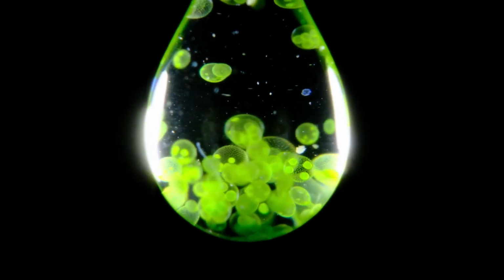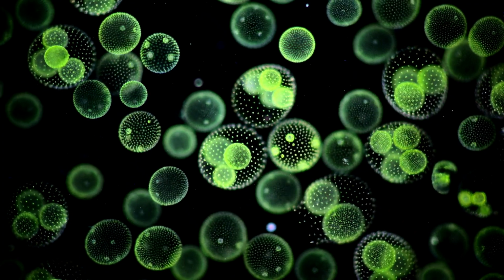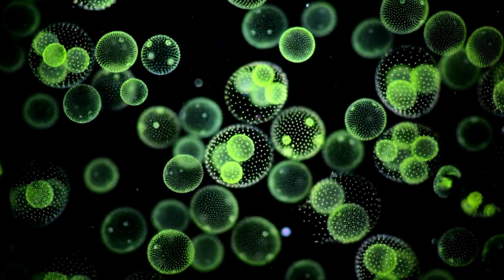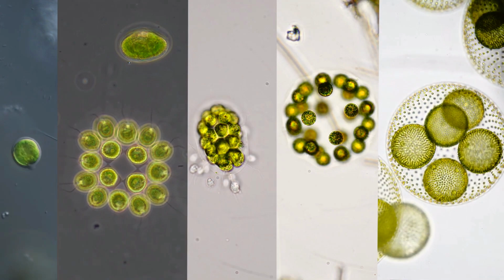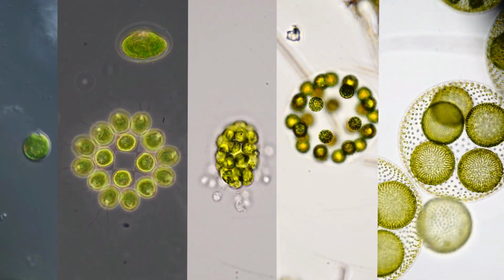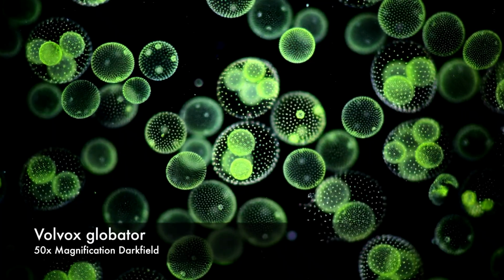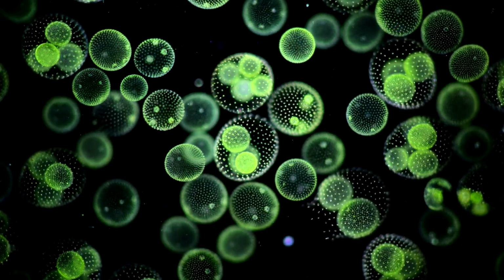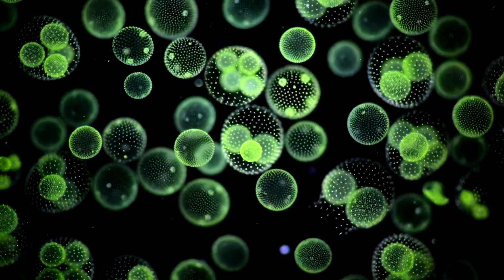This is a drop of pond water. The green spheres gliding elegantly through water are called volvox. These spherical algae offer a unique glimpse into the workings of evolution, demonstrating how unicellular life developed step by step into multicellular life. But before we get into this in more detail, let's take a closer look at what volvox is and what makes it so special.